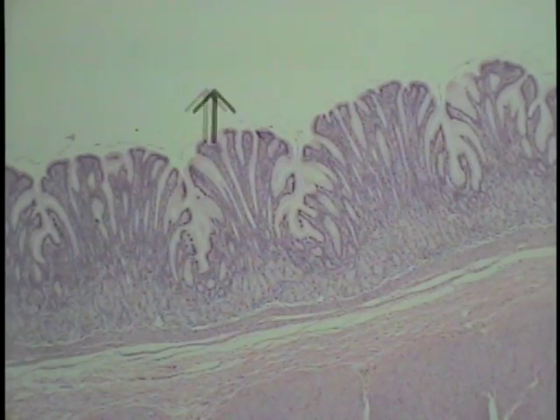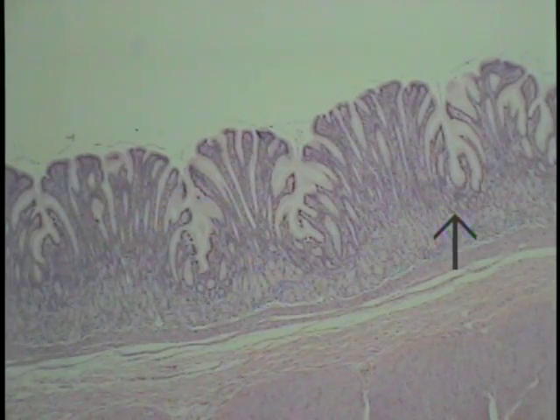So this region here is the mucous membrane of the pyloric region of the stomach, consisting of a simple columnar epithelium, typical gastric lining epithelium, a lamina propria that is invaginated in two by the gastric pits and is filled and obscured by the abundance of the pyloric glands, as indicated here. Nonetheless, it's hidden and is found around the glands and between the gastric pits where they invaginate. So that is that portion of the mucous membrane, and then of course the muscularis mucosae.